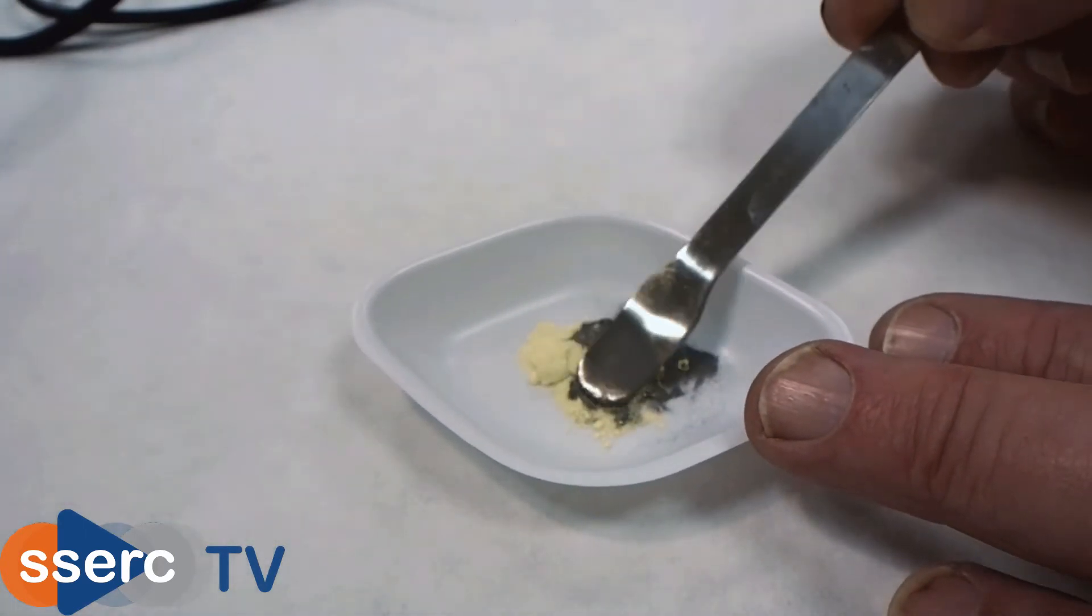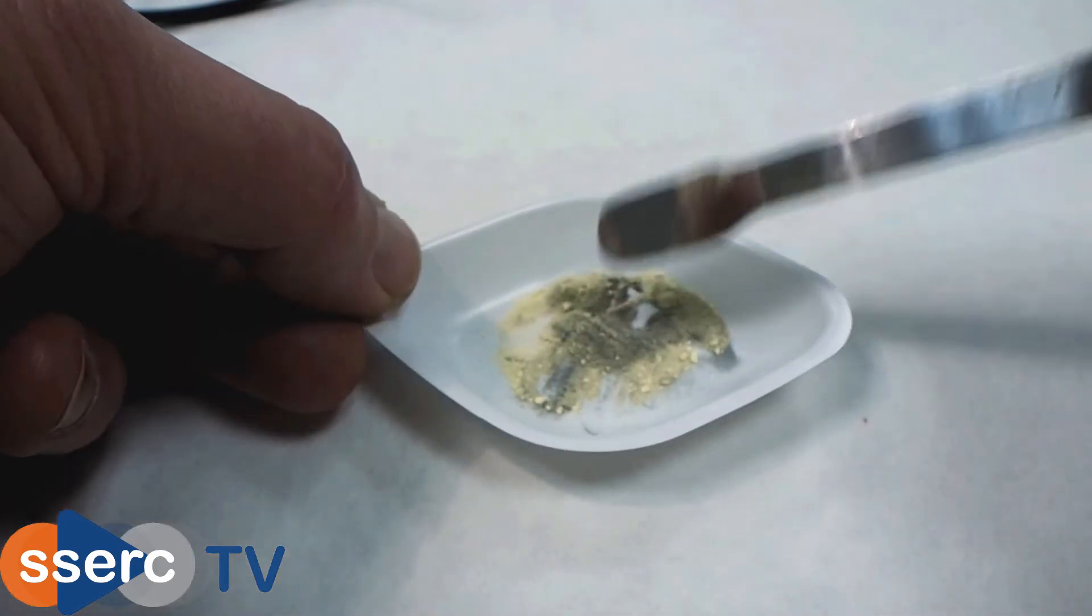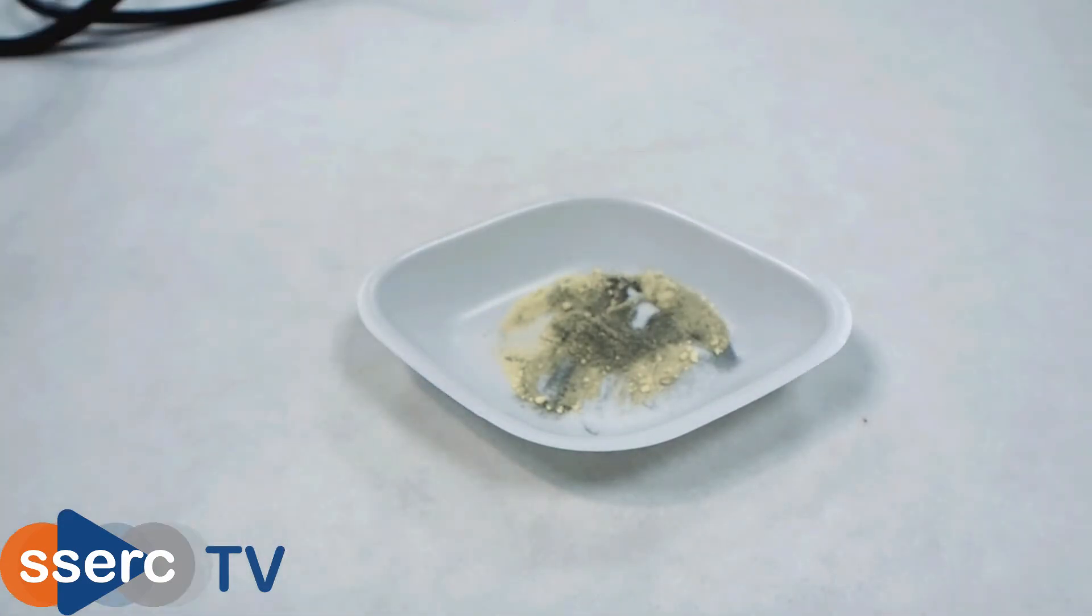First we prepare the mixture. We weigh out 0.25 grams of powdered iron and 0.15 grams of powdered sulfur and mix them thoroughly.